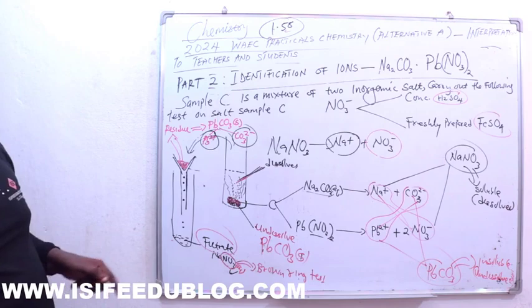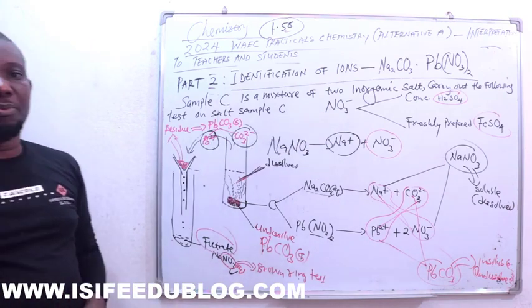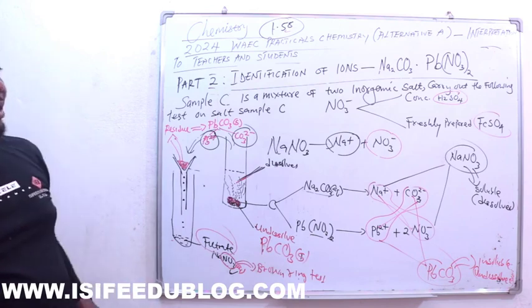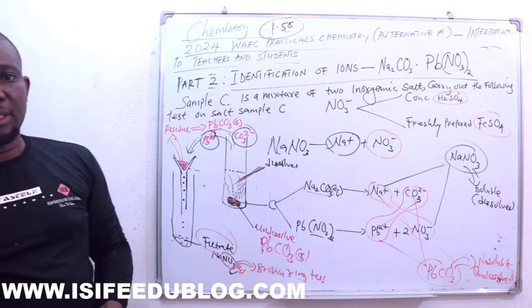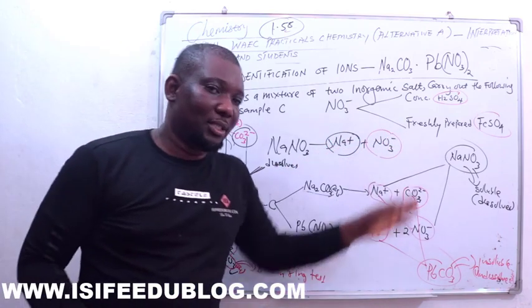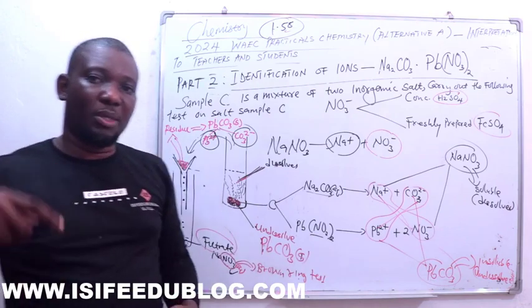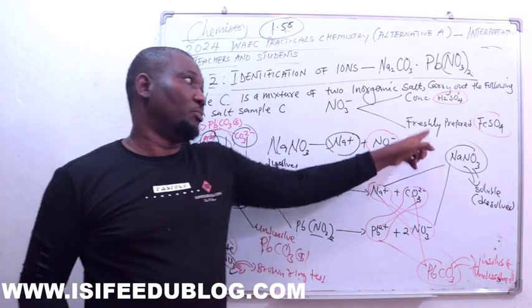So the next is now to start off with the brown ring test, and what is the purpose of the brown ring test, and as well why do we need to freshly prepare this during the brown ring formation. Now this will be prepared the very moment the exam is going on. When they are sharing question papers, the teacher should be able to prepare this.